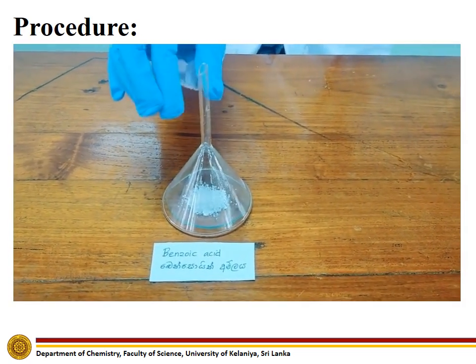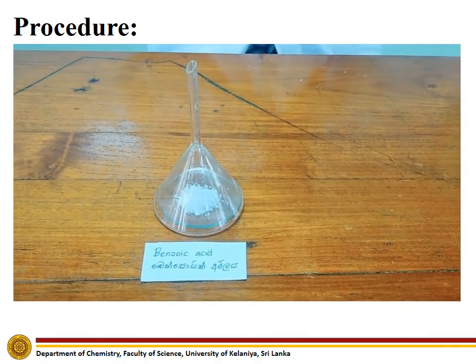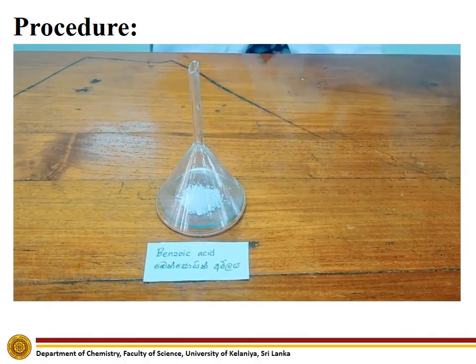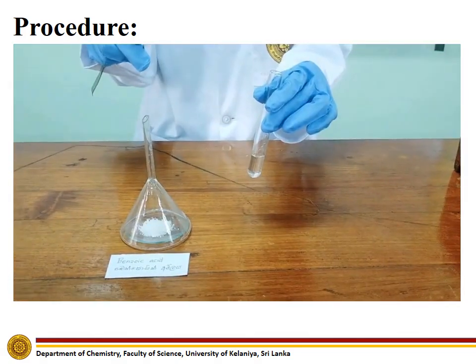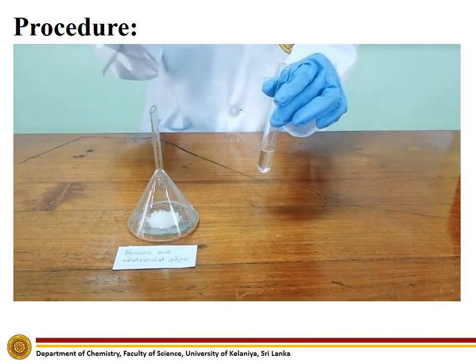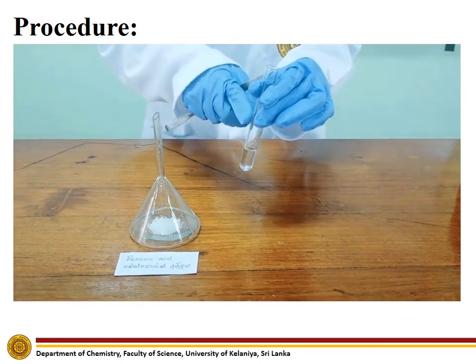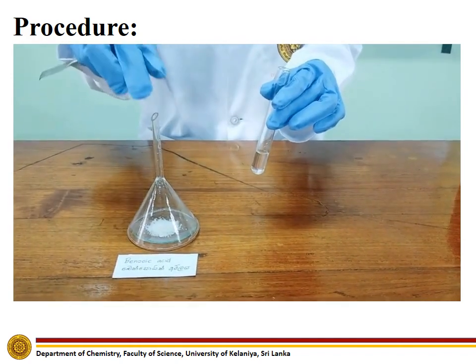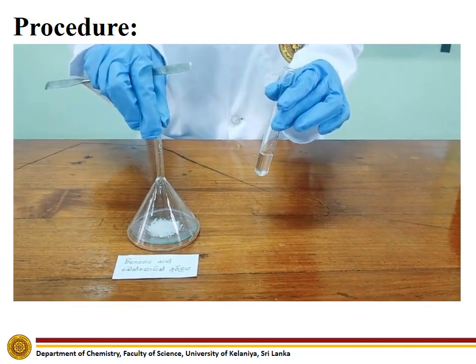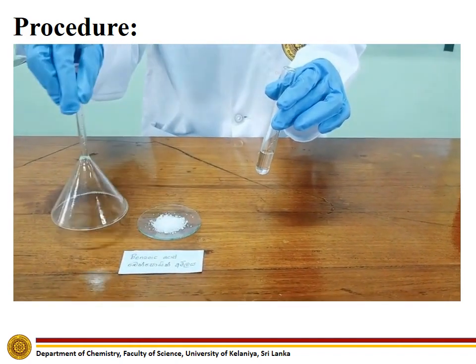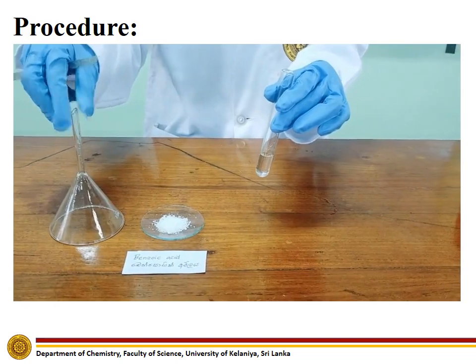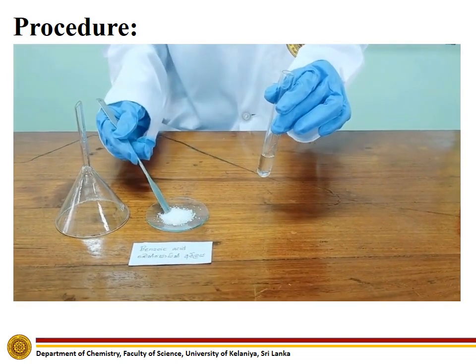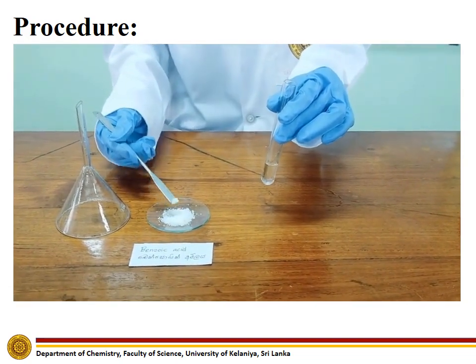Next, we are going to perform all the experiments on benzoic acid. To carry out the first experiment, add benzoic acid to a test tube containing water and check whether it is completely miscible in water.